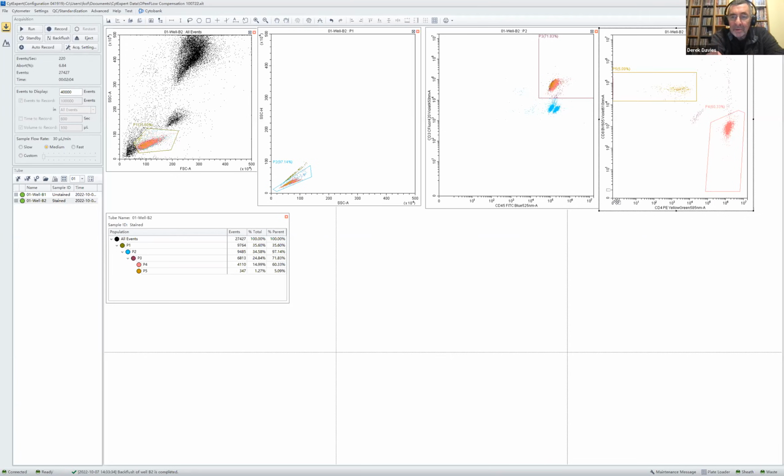Well, this is everybody's last chance, of course, to ask any questions. But thanks for all the ones that have come through so far. So there is a question. What are the two populations outside the positive population in CD45? I think I have. Yeah, exactly, those two.